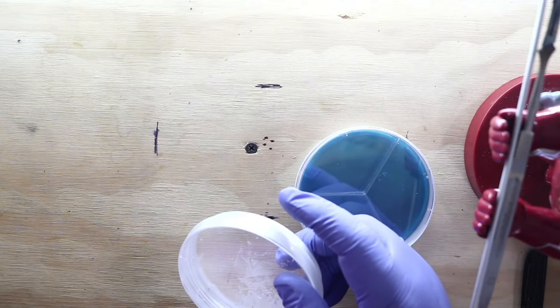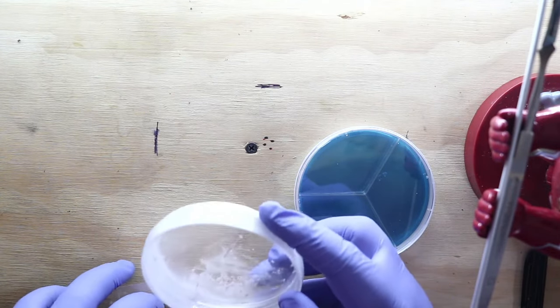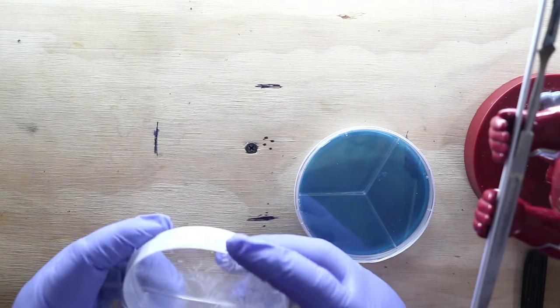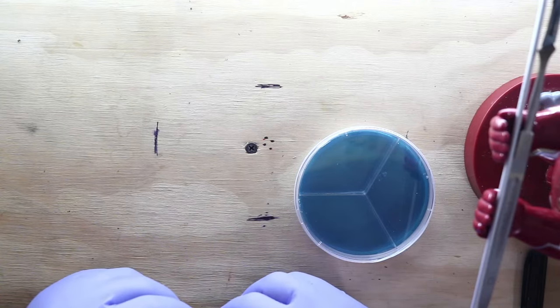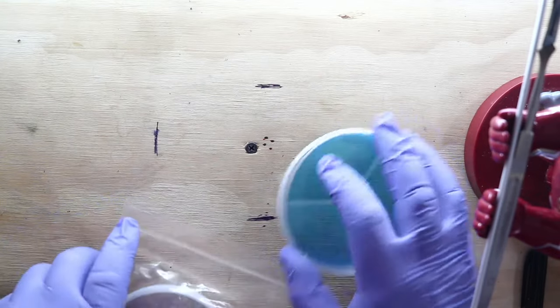So, do the grip dishes stack better? Not really. They all have rims. There's just a grip on the sides so that you can grip it better. But I don't really have a problem gripping dishes, so I'm not that worried about it.